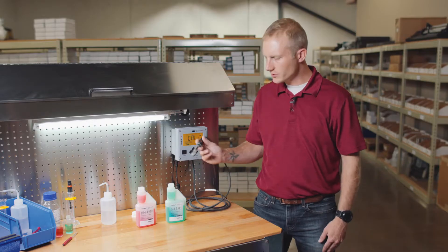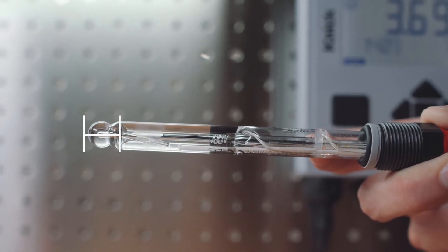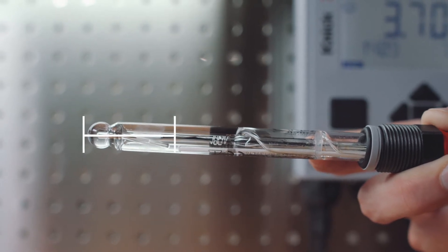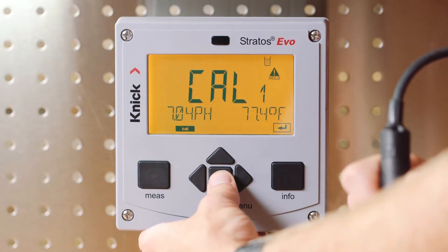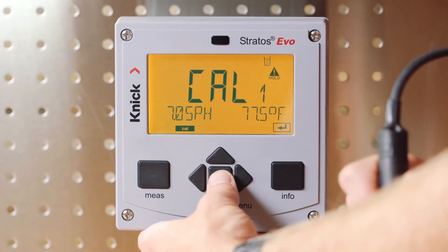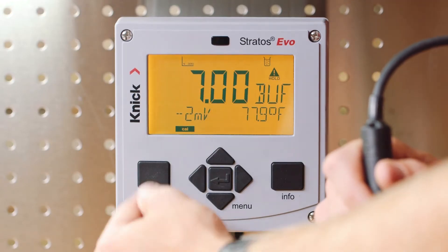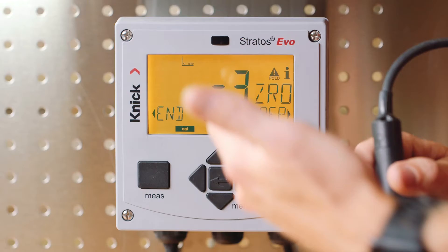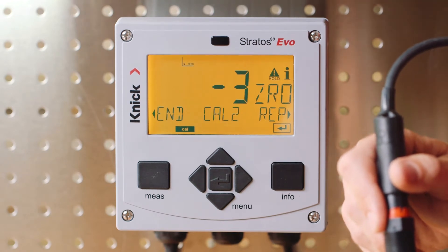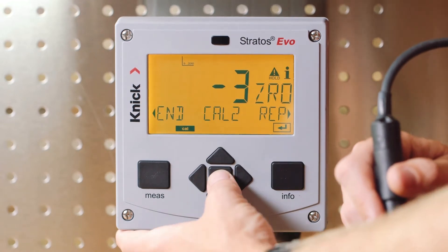It's recommended to use fresh buffer solution for each calibration. Let's place our sensor in the first buffer solution and stir lightly. We want to ensure that the entire pH measuring bulb, along with the sensor's junction, are fully immersed in the buffer. We want to ensure that both the pH value and the temperature value at the bottom of the screen have stabilized. In automatic calibration mode, the transmitter will display the recognized buffer value as well as the millivolt value. Once completed in the first buffer solution, the zero point of our sensor is displayed and the Stratasevo now prompts us to move to the second step in the calibration process. We'll press enter to continue.